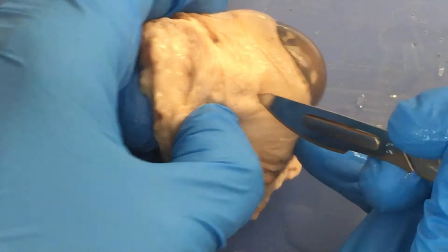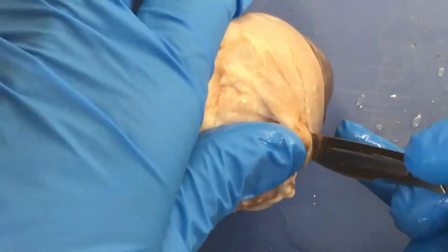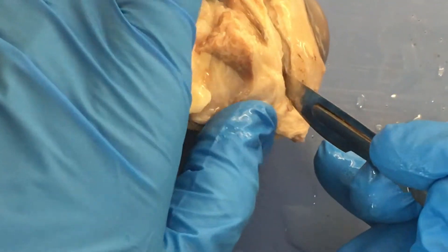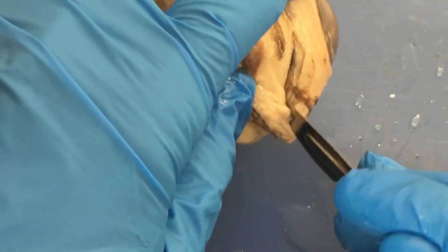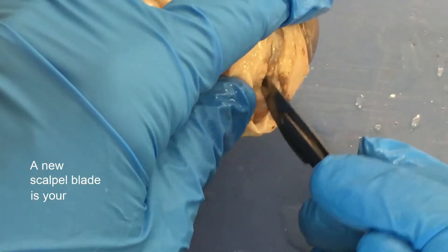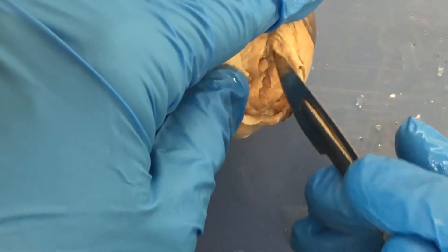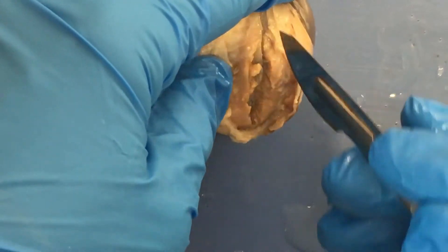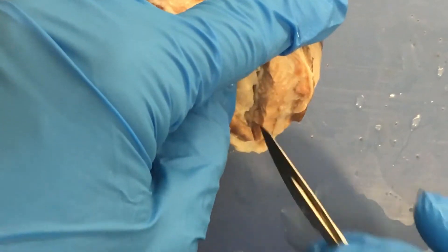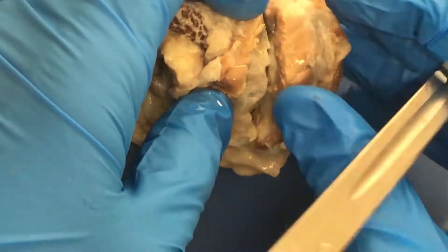The challenge is actually to cut open the eyeball, but it's actually not so bad — the wall of it is so thick. I'm using a new scalpel blade, which is always a good thing. A new scalpel blade is your dissection friend. One of the reasons I'm doing this in front of you is that there's some anatomy here that you can really only see when you just open up the eye. So I'm cutting through the sclera here.